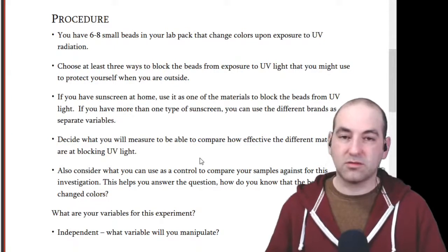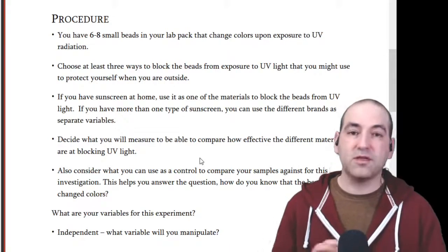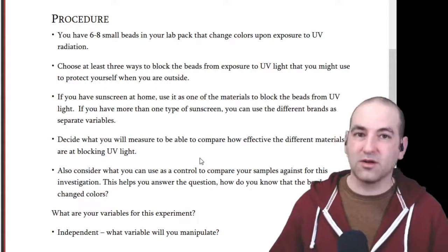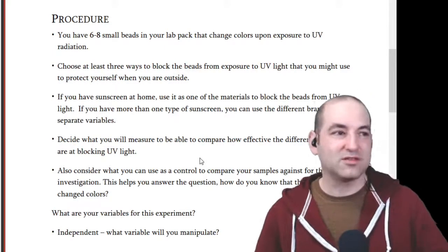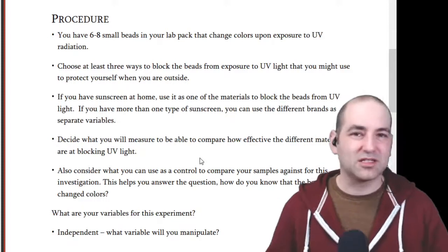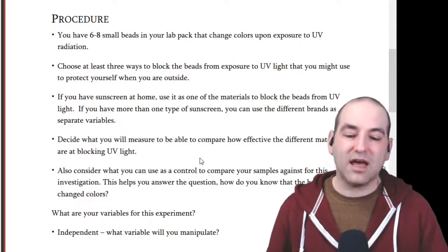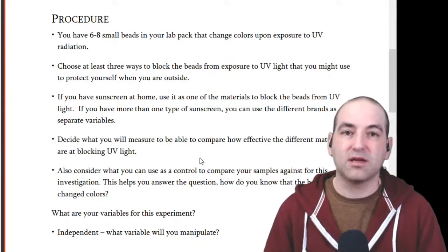Another thing that makes reproducibility important is you may not be able to reproduce your results. So you may think you've got it all dialed in, and then you do it again and you get a different result. Like one sunscreen you think is better than the other, and then you do it again and the other one wins. And then you do it again and there's some randomness there. That's okay. That may be a sign that something else is going on. Something else isn't being well controlled.